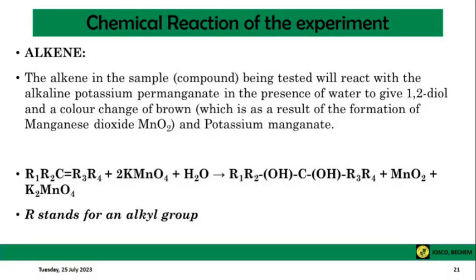Now, welcome back from watching the video. Were you able to follow the procedure very well? Are you now able to know the steps involved when using Baeyer's test to test for or identify unsaturated organic compounds? Now let us look at the chemical reactions involved in this experiment.